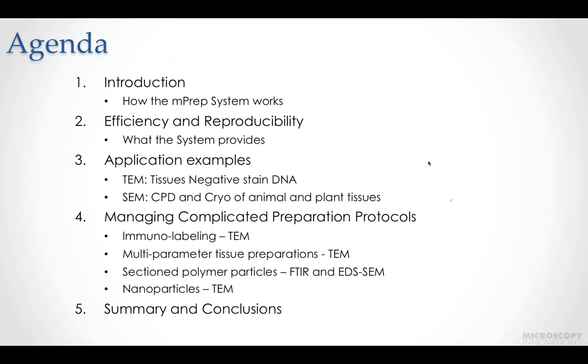The agenda for this webinar is to introduce the mPrep system and show it to some degree in comparison to existing methods of sample preparation. The next part will be to look at efficiency and reproducibility, what the mPrep system provides. Then I will explore some application examples in TEM and SEM, followed by how to manage complicated preparation protocols for TEM, SEM, and some other imaging modes, followed by summary and conclusions.